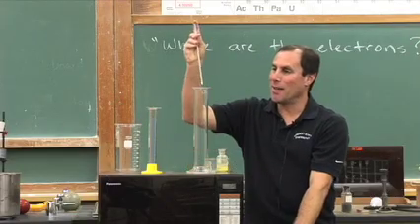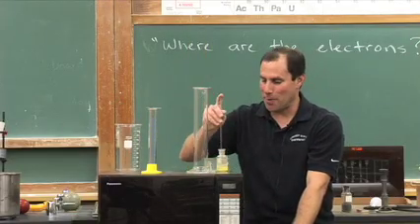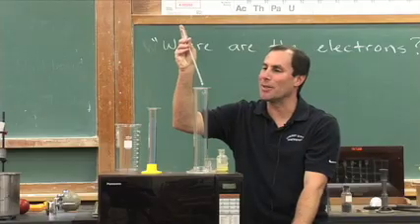I'm going to take a little bit of this solution and set it up on top of filter paper on top of these graduated cylinders.